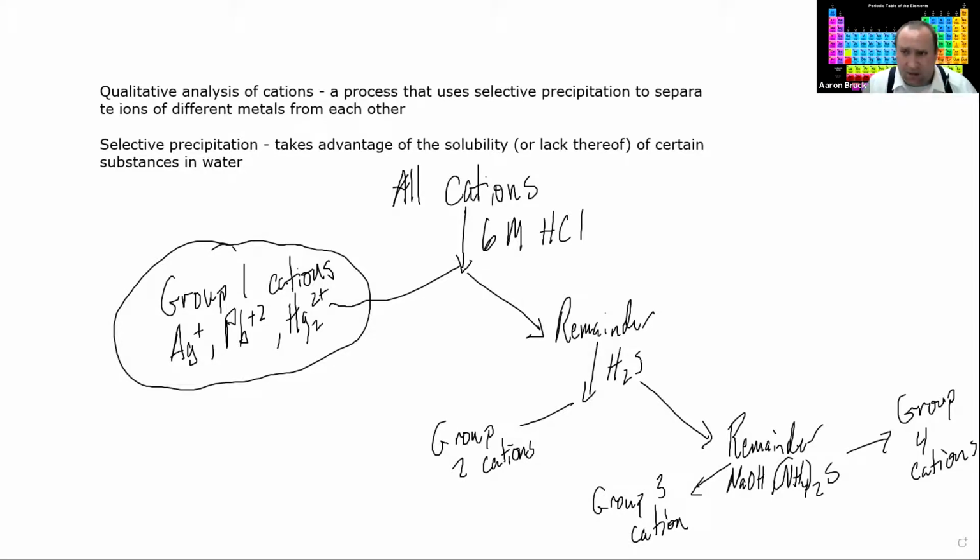Now again, in previous semesters, we would have explored this a lot more closely. We didn't have the time this semester to do that because we had a limited number of days. The group 2 analysis, for example, is a good solid 2-day procedure just to do the known, let alone the unknown. And the group 3 is similarly long. But the group 1 we can actually do within about a day. If we have a really good day, we could not only do the group 1 analysis, but also do an unknown analysis as well.